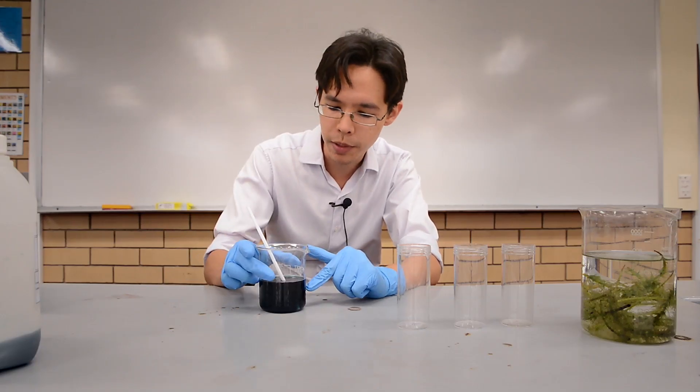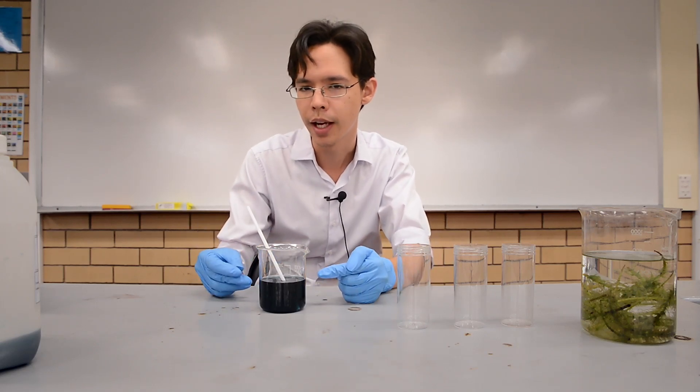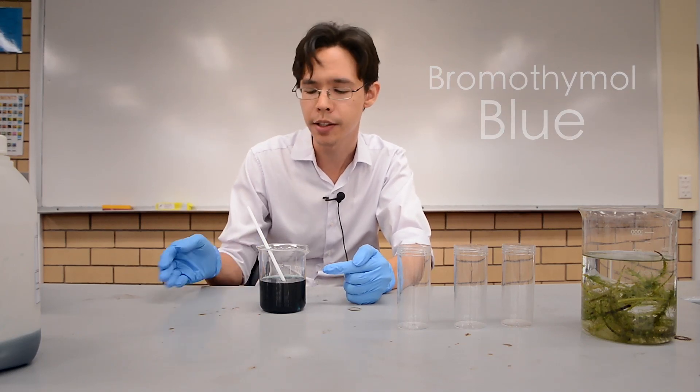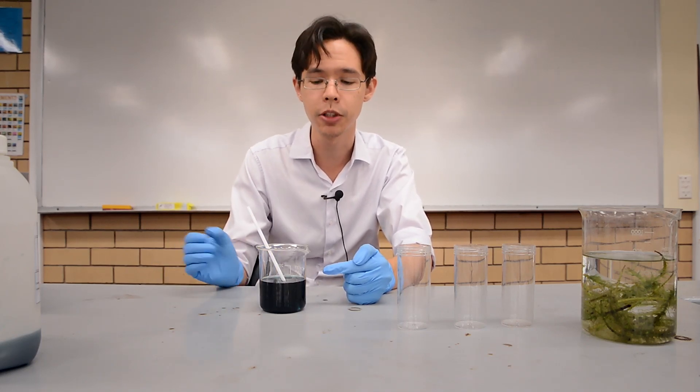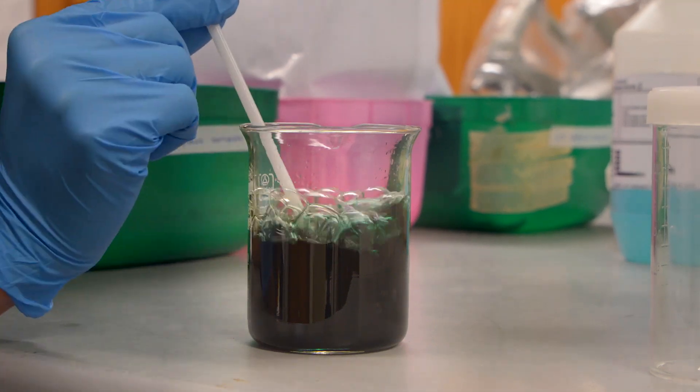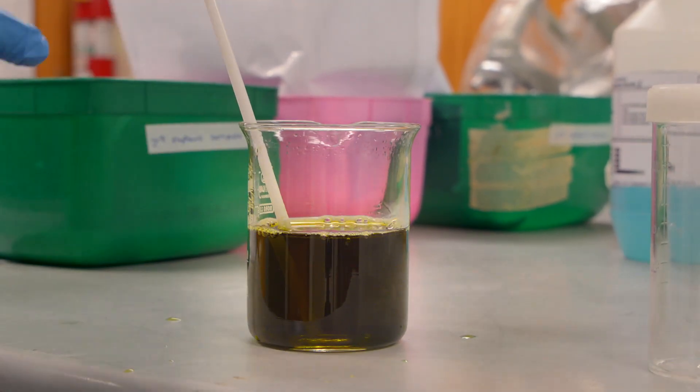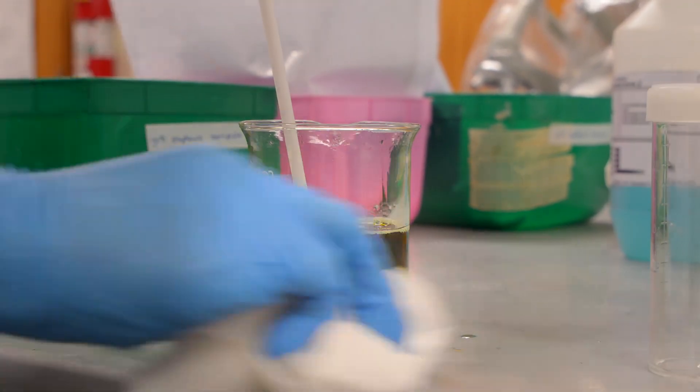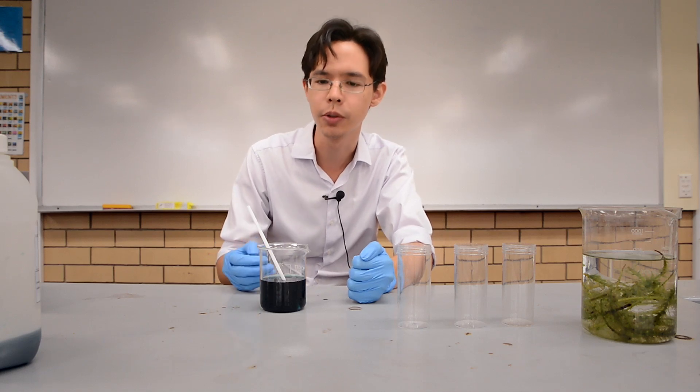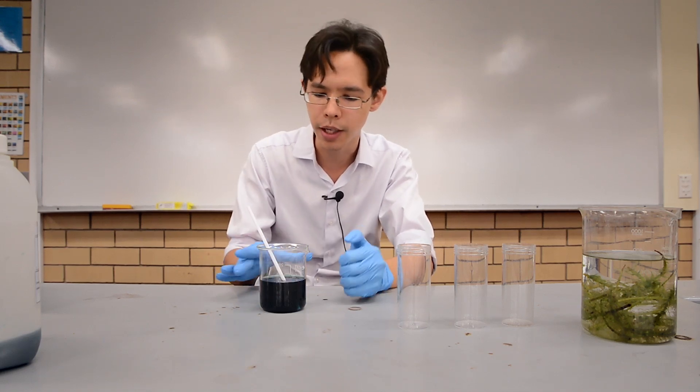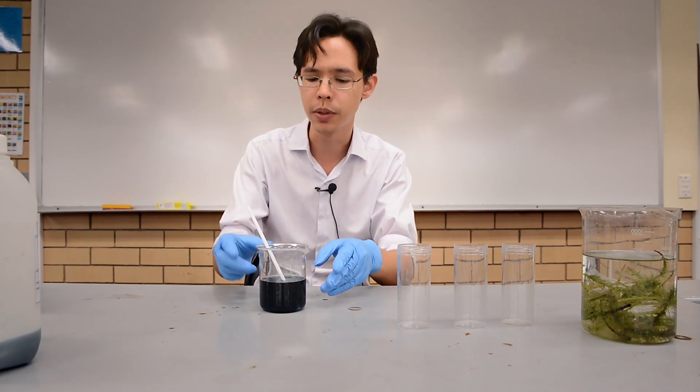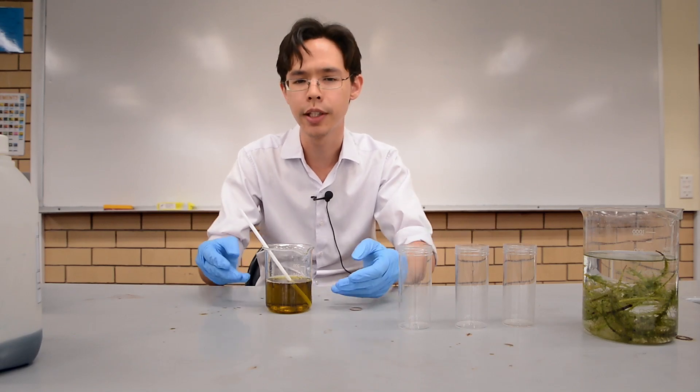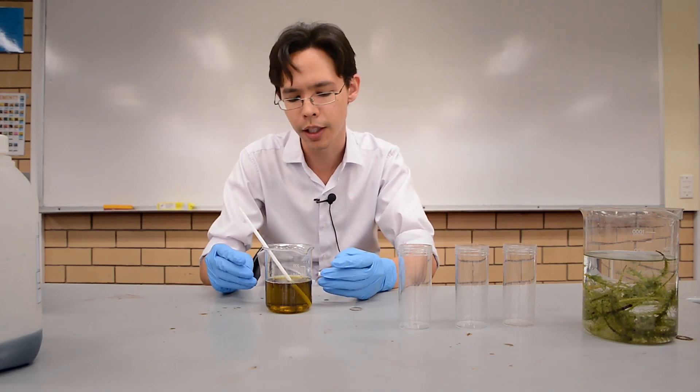What I've got in the beaker here is not just water, we've got water, mainly, and a little thing called bromothymol blue. Bromothymol blue is actually an acid-base indicator, which means that if you've got something that's very acidic, it will change to a yellow color if you've got a low enough pH. If you've got a really basic or alkaline solution, then the solution will go more towards the blue color. Right now it's about neutral and it's got a bluish color. So it's gone to a yellow color in the solution.